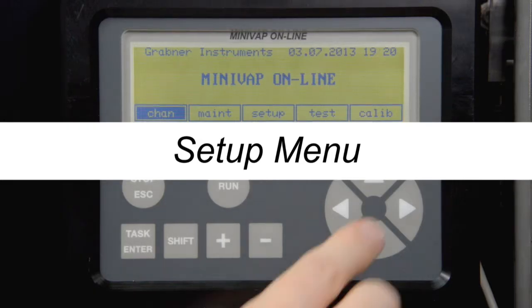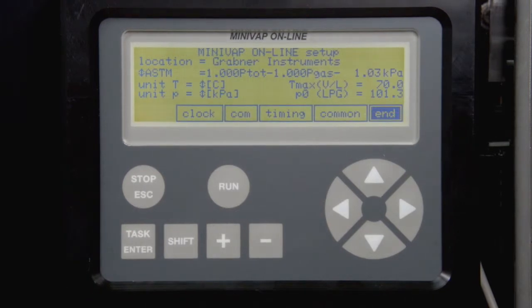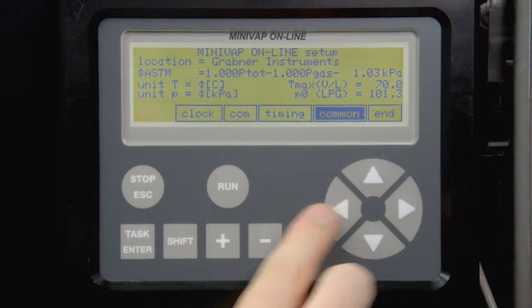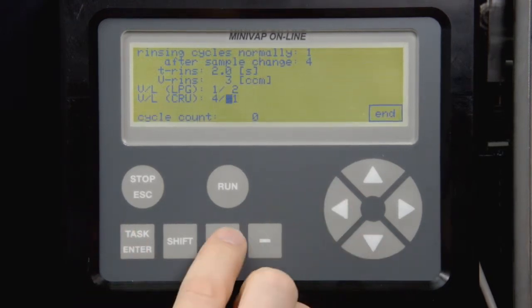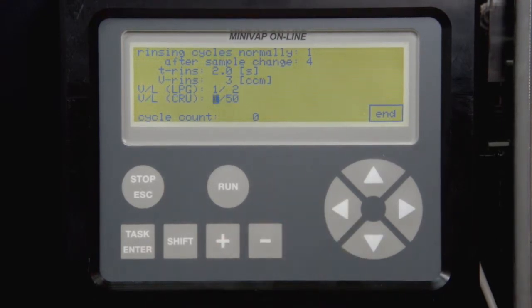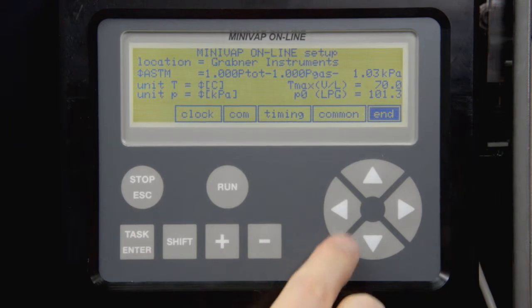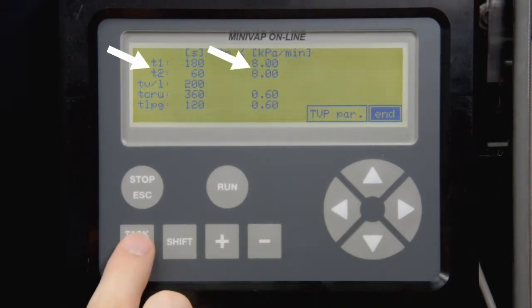Set Up Menu. The Set Up Menu allows the user to manage methods and settings, like correlation formulas, temperature and pressure units. Go to Common to change the number of rinsing cycles and the rinsing volume, or the V over L ratio for crude oil and LPG measurements. Go to Timing to change equilibrium times and pressure limits for measuring methods.